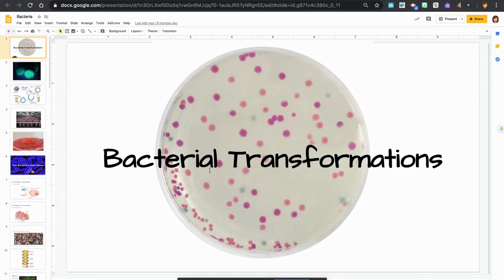Bacterial transformations. In biology, to transform means to put new DNA into something. The easiest living thing to transform is a bacterial cell. They're cheap and fast replicators, and every time they replicate, their ribosomes are used to produce the protein you injected into them.